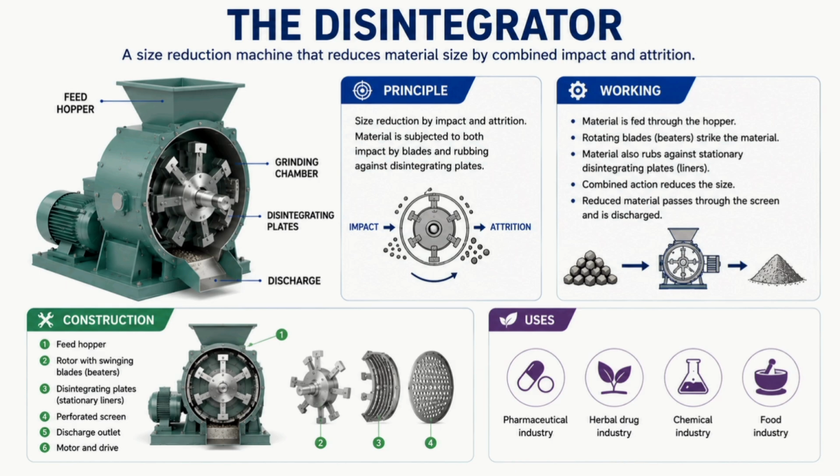Coming to the uses, the mill is used to powder all types of drugs including very hard drugs. The drug should be dried before feeding into the disintegrator to get a fine powder. To avoid jamming of the beaters of the disintegrator, use moderately small pieces.